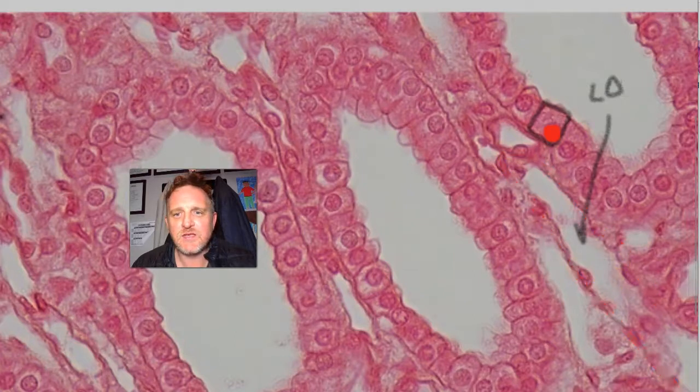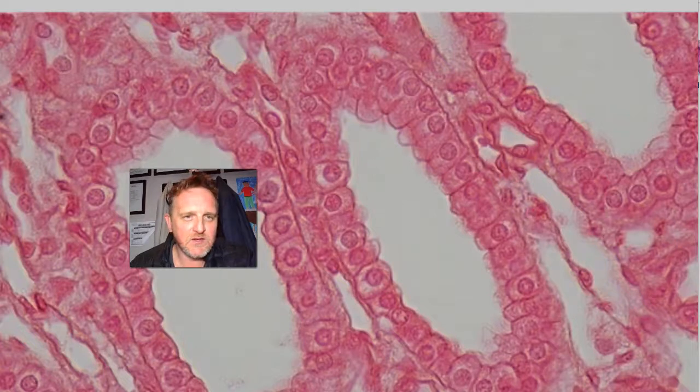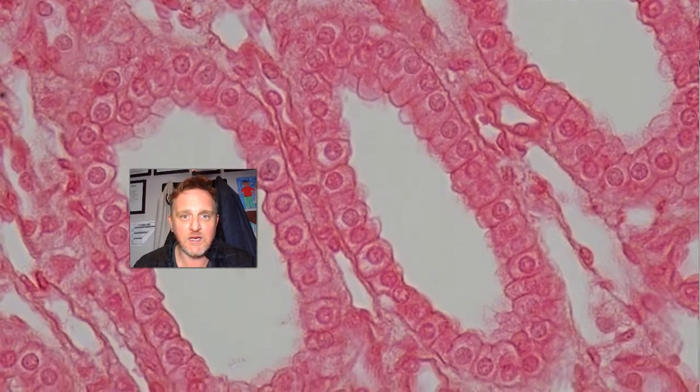Let's remove these annotations and show you a second piece of information that you can add to your study notes. So stratified, here's a simple cuboidal. Note in the previous video I said columnar. Hope you caught the mistake and corrected it. So it's a cuboidal epithelial cell. This is simple cuboidal epithelium. Simple cuboidal epithelium. They're collecting ducts in the kidney, the renal parenchyma.